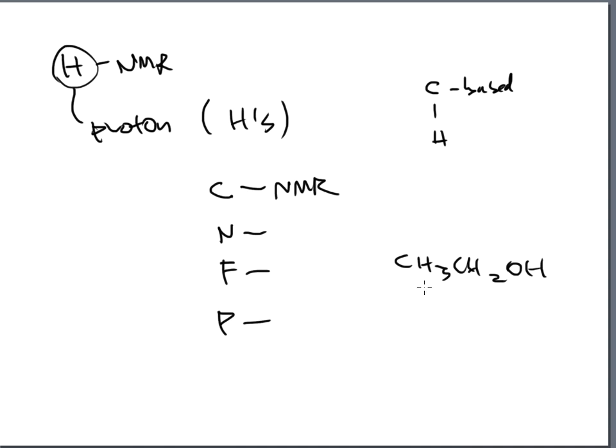And look at this. There's hydrogens here that it can report. There's hydrogens there that it can report. There's possibly a hydrogen here that it could report as well, depending on what we do with it. So we get this sense that we can get a little bit of everything about the molecule if we stick to our guns and do hydrogen NMR for our studies and for our reports.